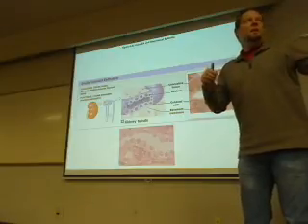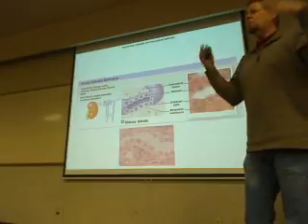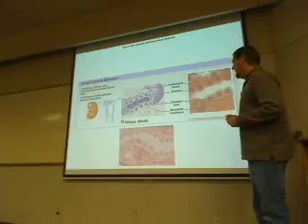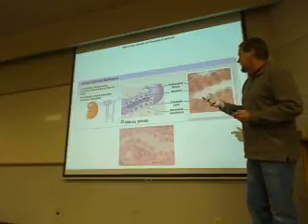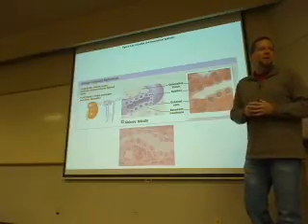And when you look at it under the microscope, this is what these early guys saw. And they go, oh, it looks sort of like a cube, we'll call it cuboidal. What happens with students sometimes is they come in and go, it doesn't look exactly like a cube. Duh. You know, it's in a human being, it probably won't. Also keep in mind that when you get tissues from a human being, you also have to prepare the tissues, and that probably alters their shape just a little bit.